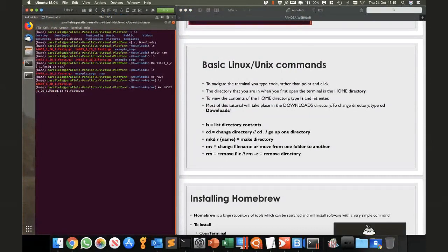I mentioned that the fastq is the raw output. GZ means that it's been compressed with something called gunzip. A lot of programs will read it with the .gz, so you can leave gz as it is. So we hit enter, and then we'll go ls again, and we can see now that I've renamed my file r1.fastq.gz.